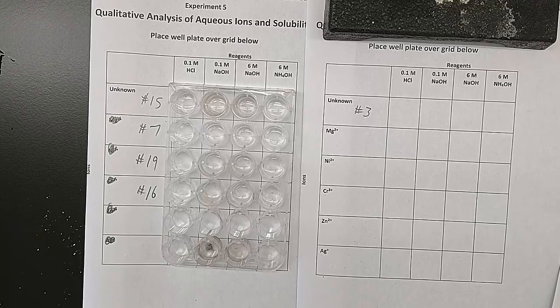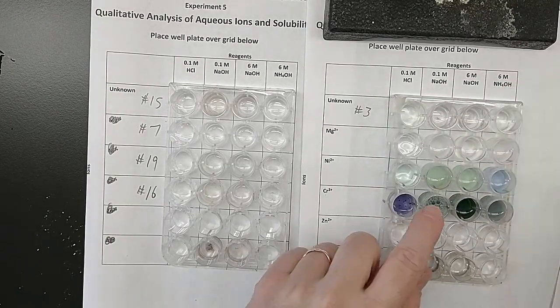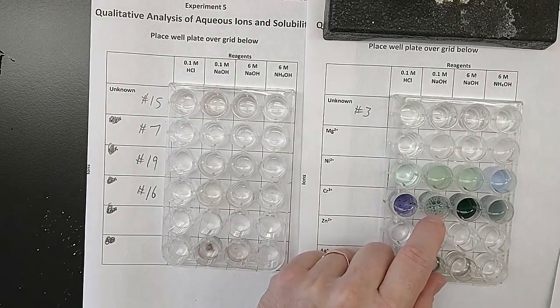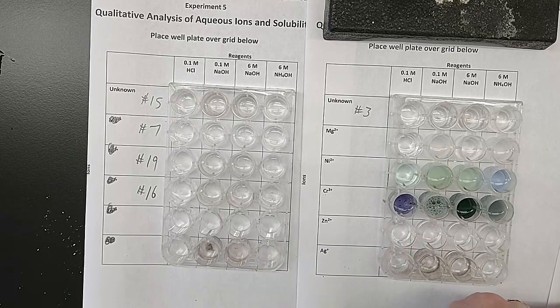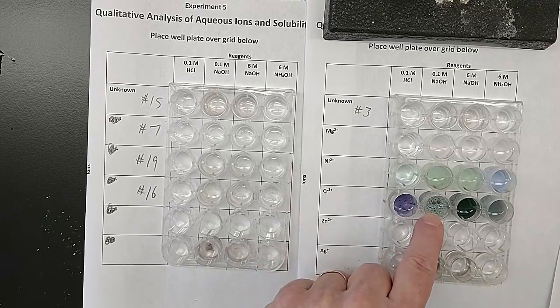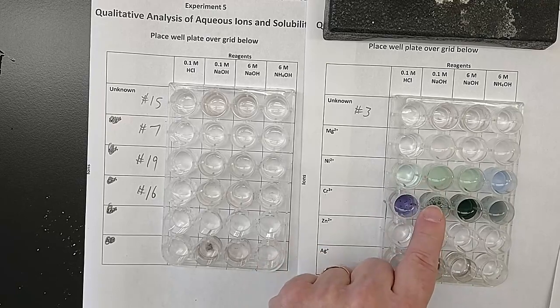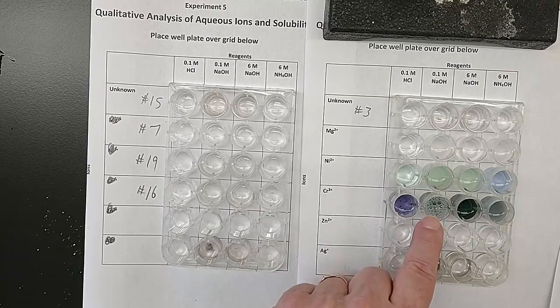This is cloudy but green. Okay, chromium plus a little bit of sodium hydroxide is cloudy and green. It is a darker green than the nickel, but it is definitely a green. So it went from purple, it turned color to green. The nickel started green and went cloudy to green. So I'm going to call this cloudy dark green.